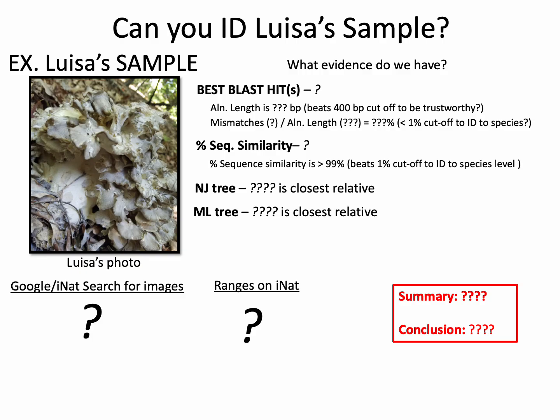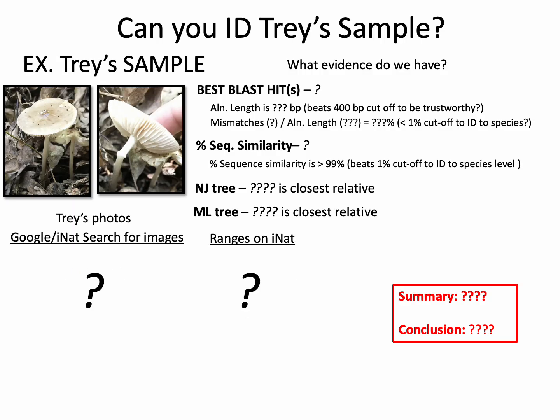So the challenge I pose to you is to collect all of that information to ID Louisa's sample. And I am not going to provide you the answers. It's up to you to figure that stuff out and draw your own conclusions. And then do the same for Trey's sample. And once again, I'm not going to provide the answers in this case. It's up to you to figure it out and do your best. Good luck.